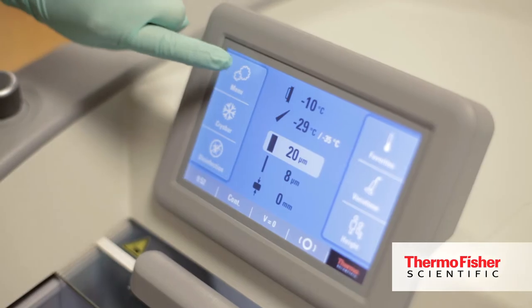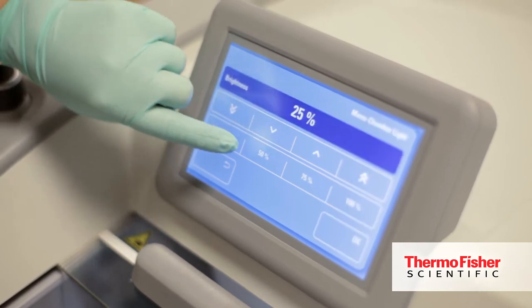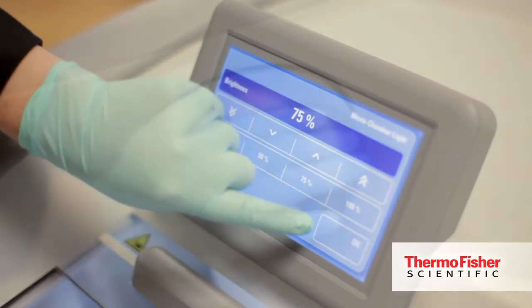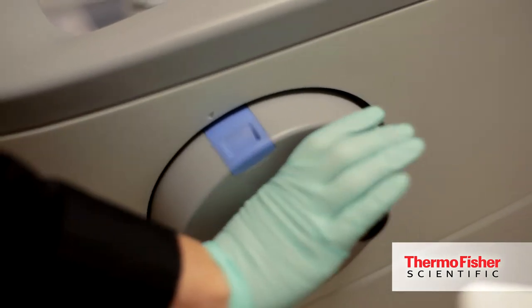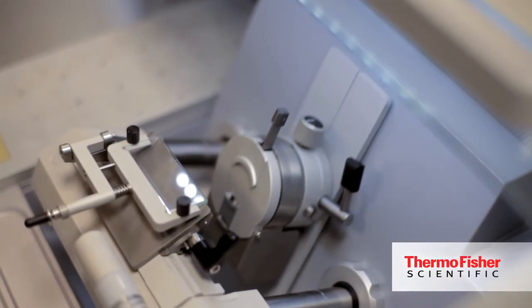It is very easy to use compared to conventional cryostats. You have the touchscreen user interface which is very intuitive. You also have the cross roller bearing hand wheel which will allow you this ergonomic comfort that our users have grown accustomed to. And you'll also notice some sleek design that allows you to step into the cryostat, again building this unit all around the customer.